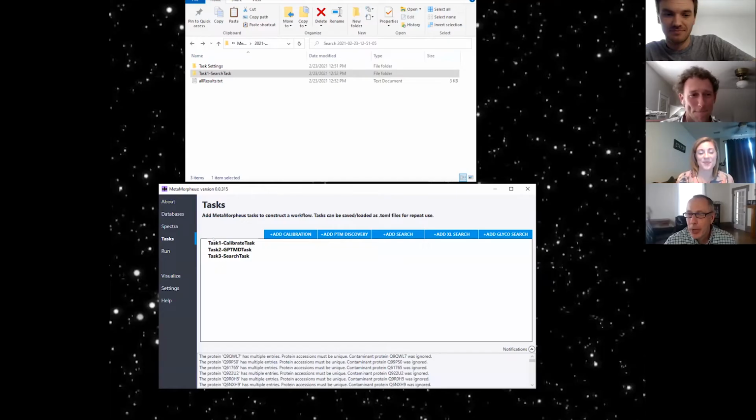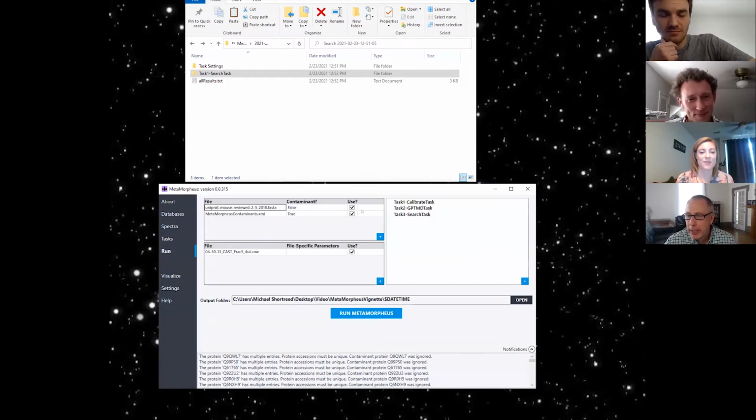Is this the magic of TV? Yeah. So you see here, I have exactly the same 3 tasks set up that Rachel just set up. And the reason that we're going to hit run here and not just go to the results is that this is going to give us about 5 minutes to talk and chat between ourselves. But occasionally we're going to go back here so that you can see what's going on in real time, if that makes sense.